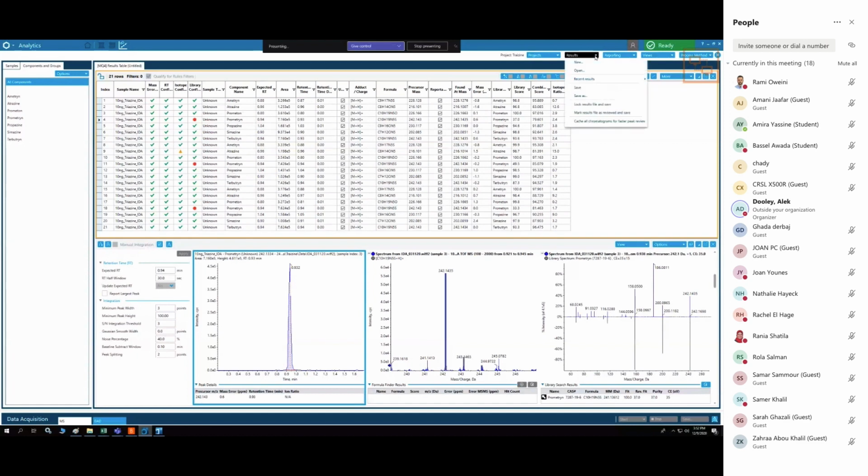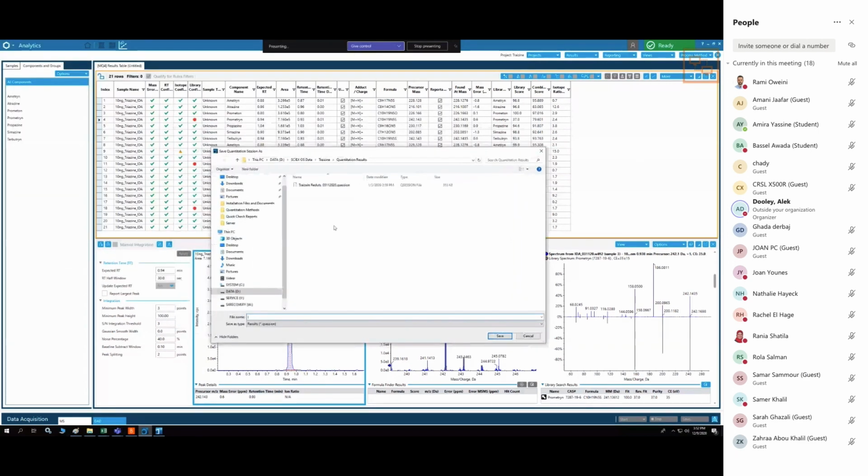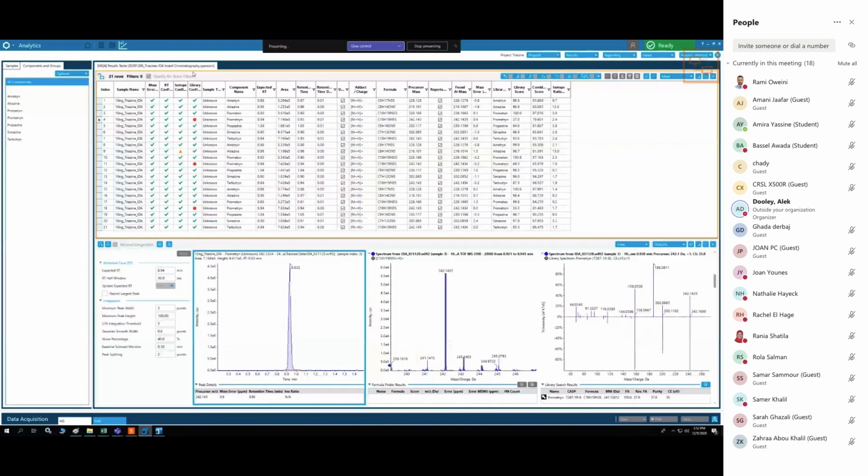So I'm going to save this chart. So we have the data saved, the results chart, so Save As. Now I use the same date that I used for the data file. So this data was collected yesterday, so I'm going to use yesterday's date, which was the 8th of December. And then I will say triazines IDA, and I will put in the chromatography, right? Because that tells us. Chromatography, yeah, it's spelled right. Okay. All right, so that chart is saved.